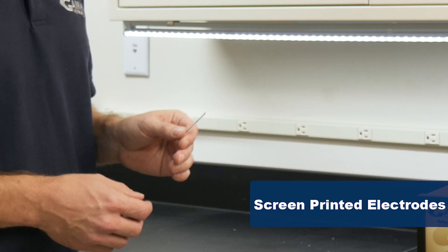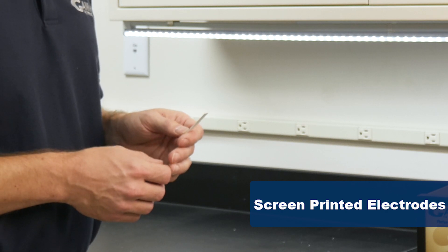I have a screen printed electrode here. We have platinum, we have carbon, and we have gold.